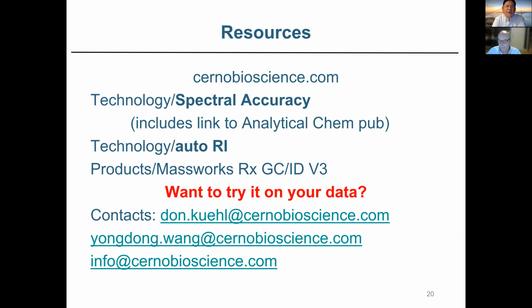So the first question down is, do I have to acquire GCMS data in the profile mode for Gcid? Oh, that's one thing I forgot to show. I skipped that part. No, you don't. That's something that was requested, and that's new in our version 3: you don't need to use profile mode data.